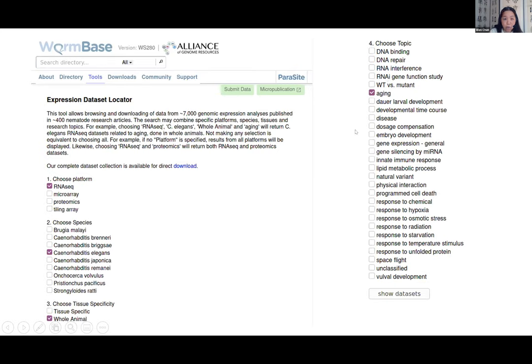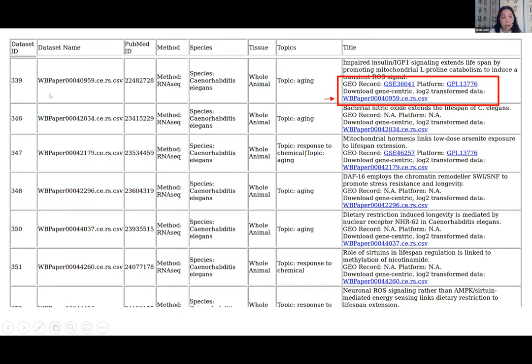For example, selecting the 'aging' topic with RNA-seq, C. elegans, and whole animal gives you a table of all relevant datasets. You can follow links to Gene Expression Omnibus to download raw data, see the platform, and download a tab-delimited file of all FPKM values mapped to the current genome. For example, the downloadable file from the Dataset Locator is now mapped to WS280.